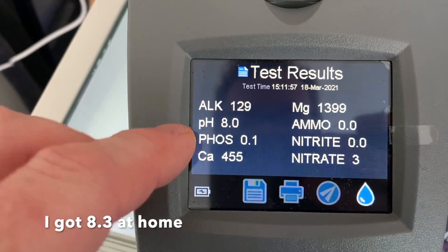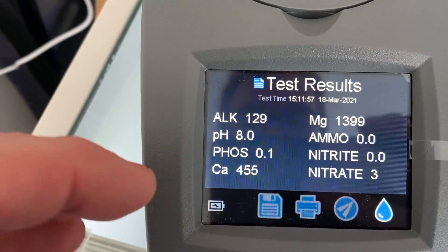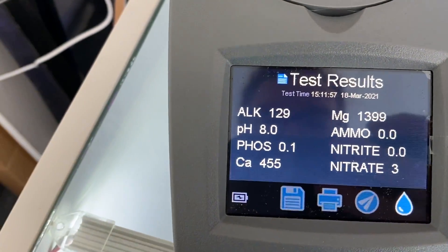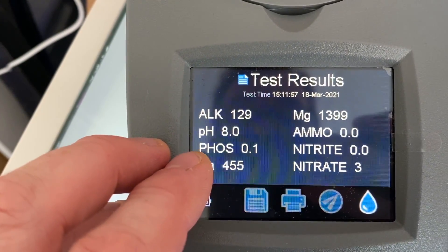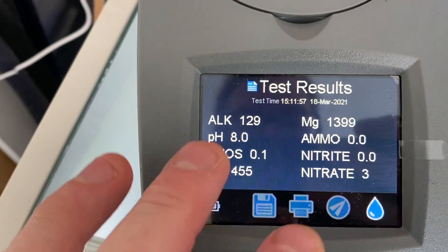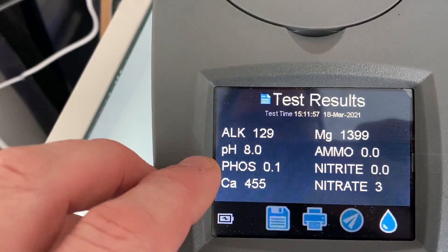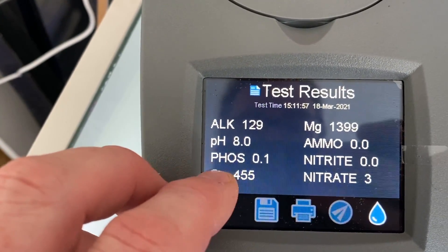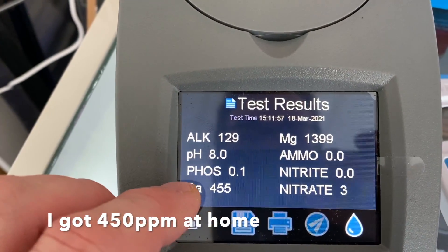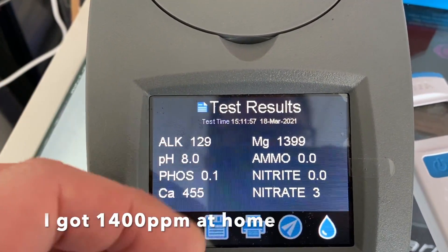pH is 8.0 — that's fine. Phosphate is coming up at 0.1. One thing to bear in mind is that when testing phosphate on this unit it's not giving you a three-decimal-place result; it's more a rough indication as to whether you need to bring out the Hanna checker to go further. At 0.1 I'm happy, and I'm getting about 0.04 at home with titration kits. Calcium at 455 is almost identical to home results. Magnesium at 1399 is about exactly the same — I was getting 1380.